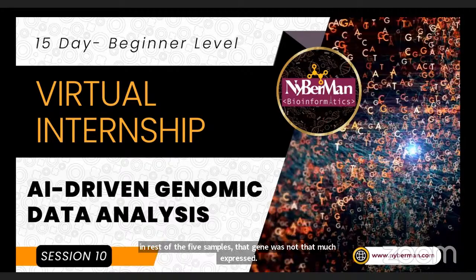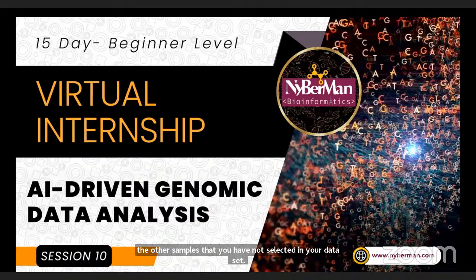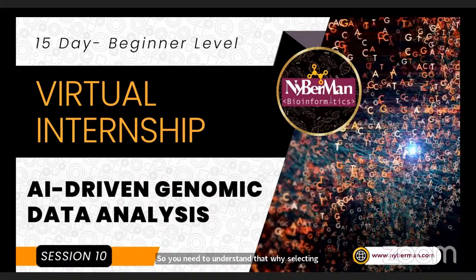So it means the gene you are claiming is highly expressed in all the disease samples does not have the potential to be a good biomarker, because the other samples you have not selected tell a different story. You need to understand why selecting more samples in every condition is important, so that your results can be generalized.